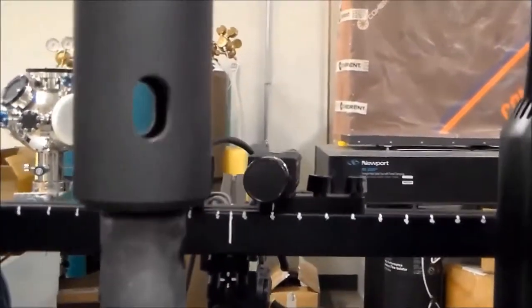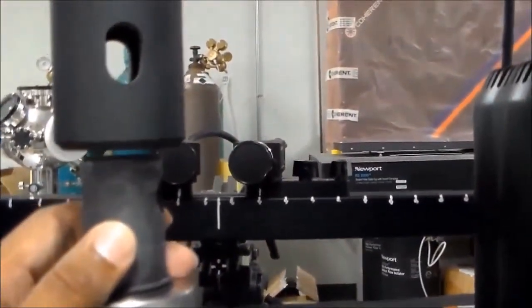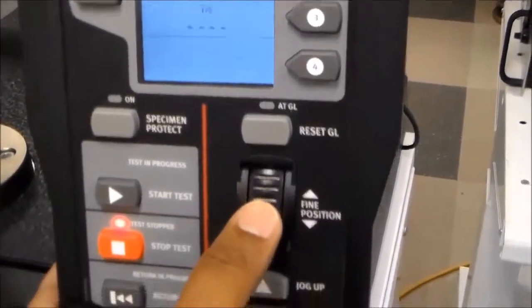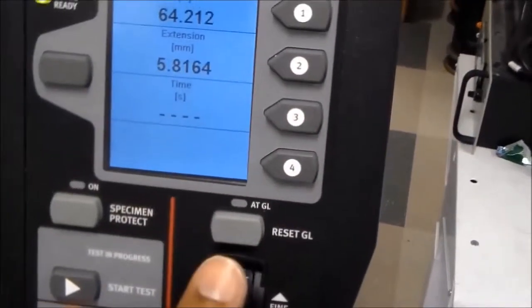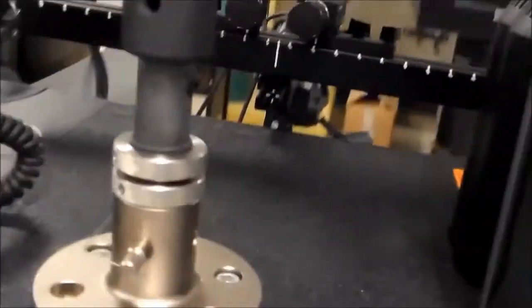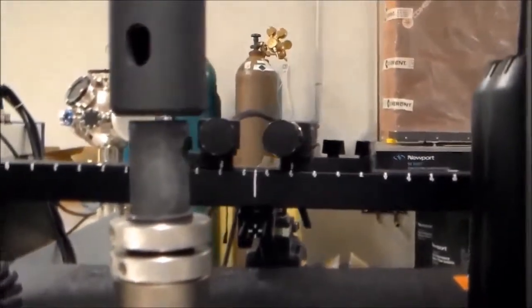When the grip is almost near the base, instead of using the down button, switch to the fine position scrolling system. Scrolling downward moves the frame very slowly, so you can be sure you are not creating compression on the bottom part.